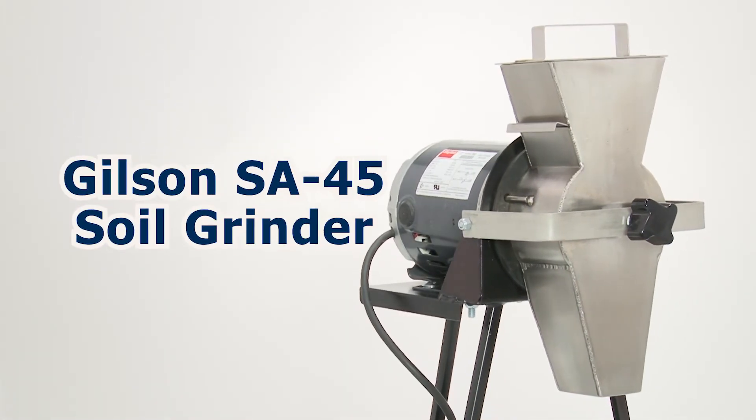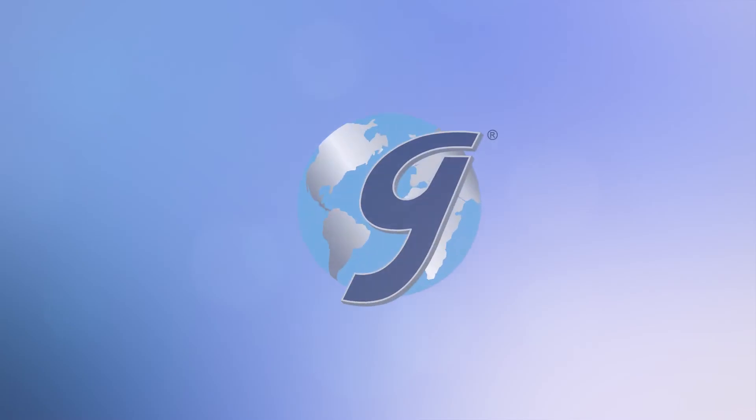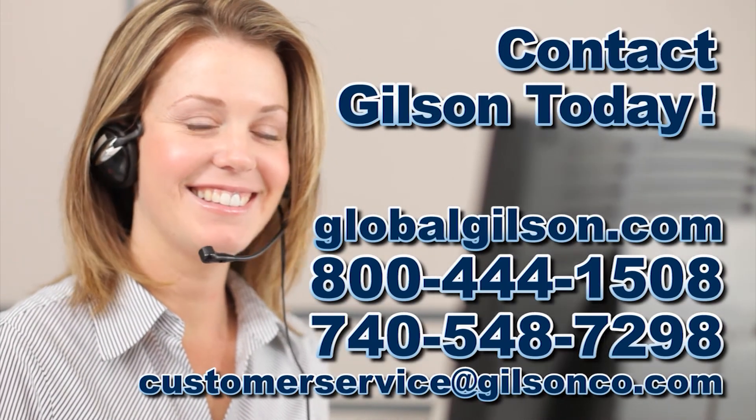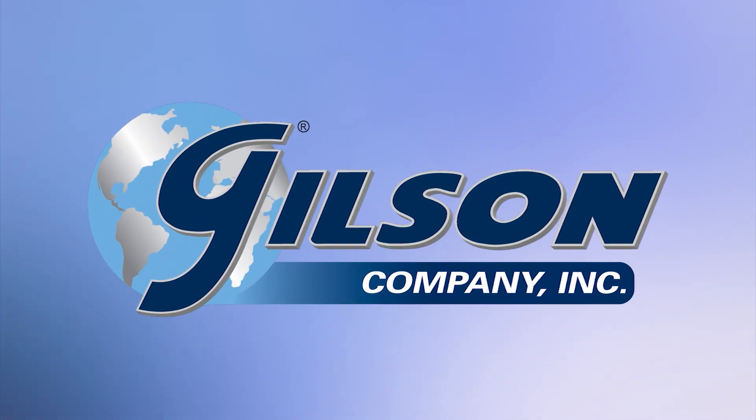This makes the Gilson SA45 Soil Grinder the right choice for your material testing lab. Be sure to check out this and all our products listed in the Gilson catalog and on the Gilson website. Gilson — your industry leader for materials testing equipment.